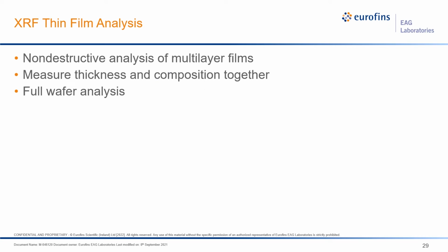We'll wrap up our set of applications now by looking at some examples of thin film analysis, including non-destructive analysis of multi-layer films, determining thickness and composition in the same measurement, and finally applying these methods to the analysis of full wafers.